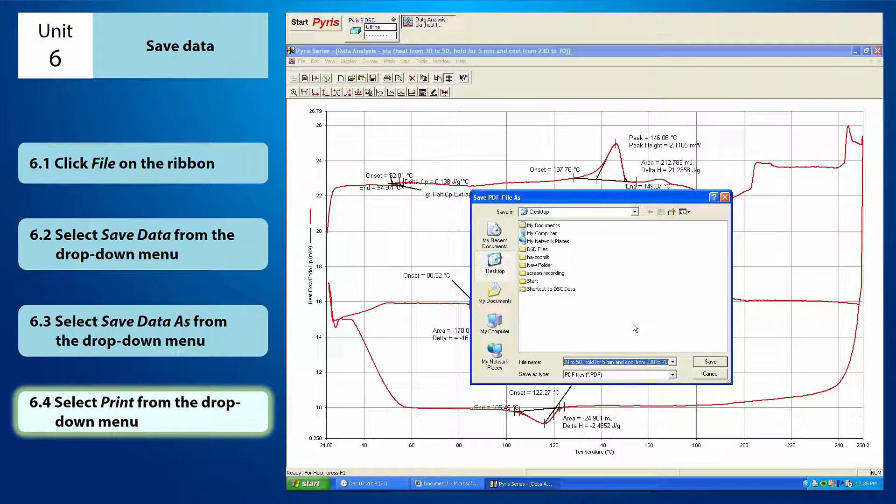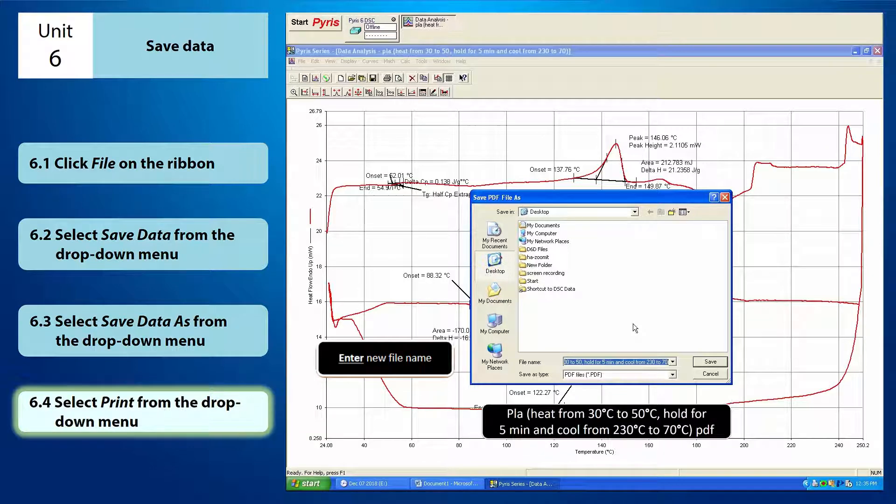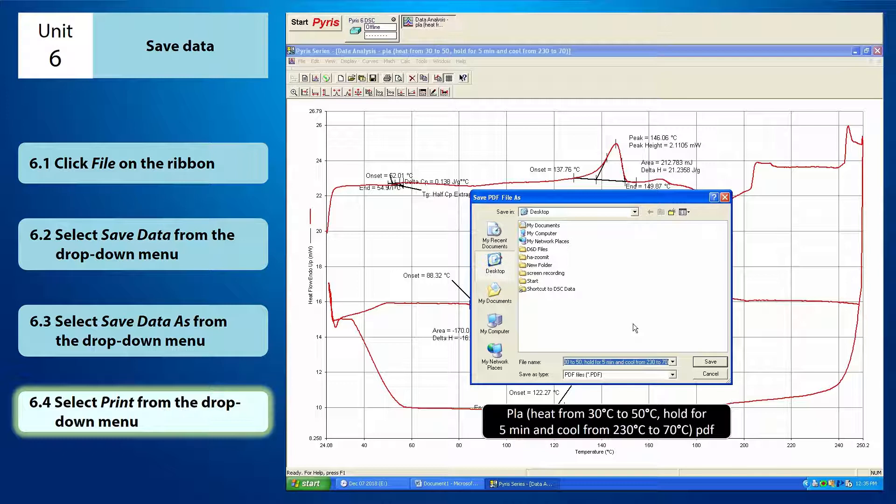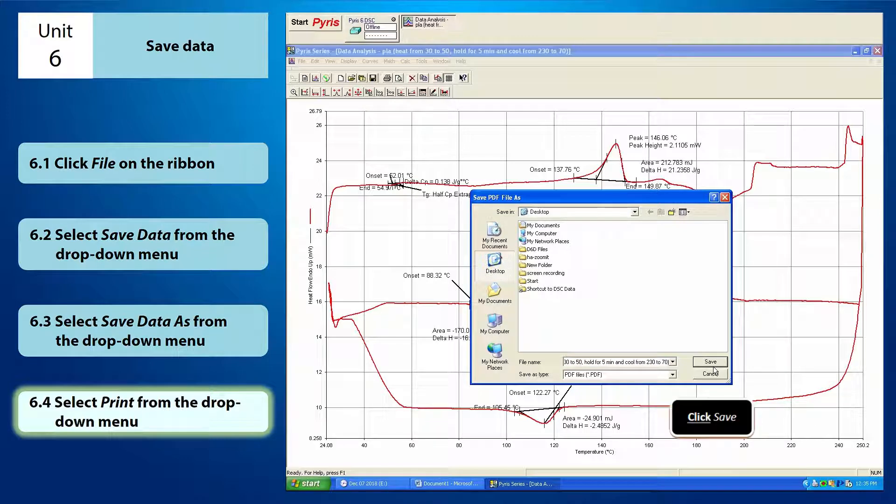Now, I'm going to save my file on the desktop and I'm going to rename it into PLA in bracket, heat from 30 Celsius to 50 Celsius, comma, hold for 5 minutes and cool from 230 Celsius to 70 Celsius, PDF. Lastly, click save.